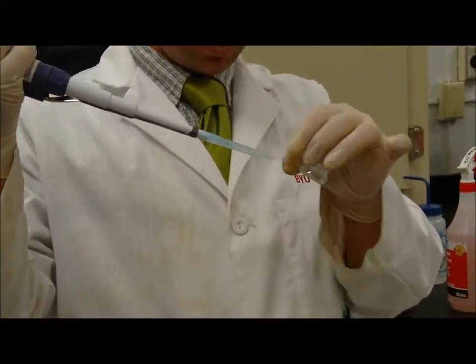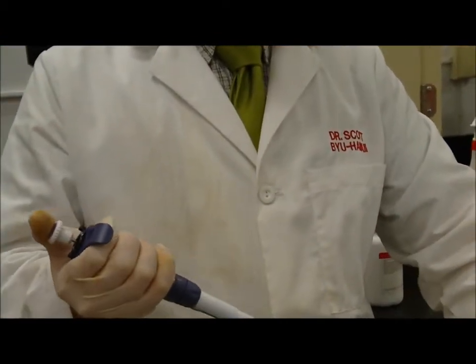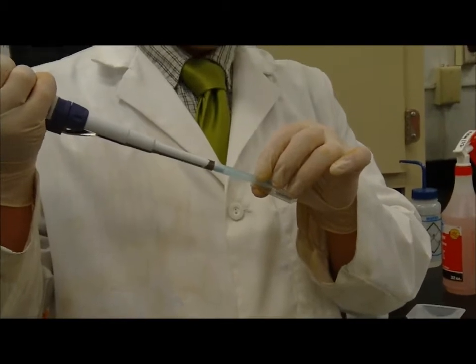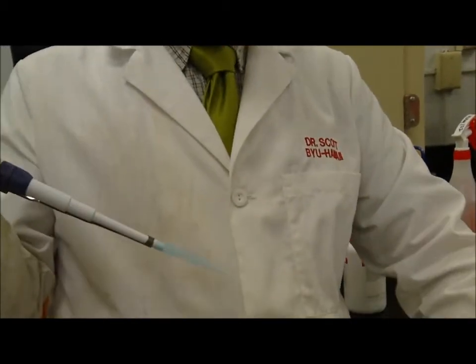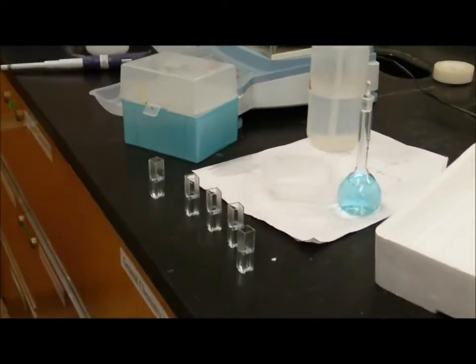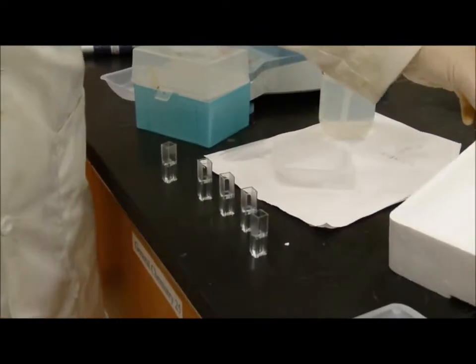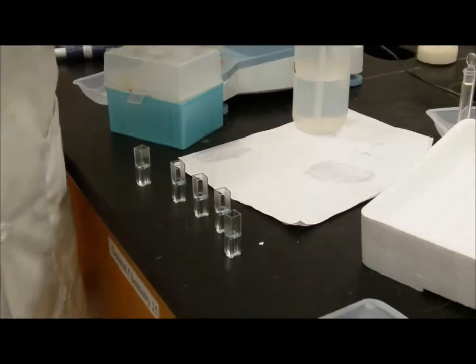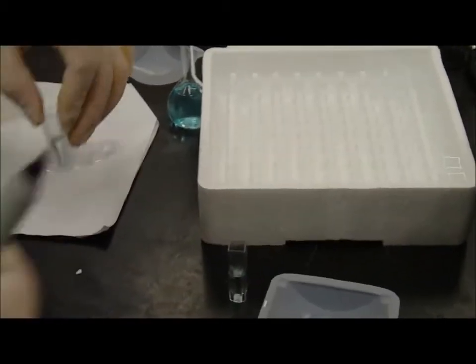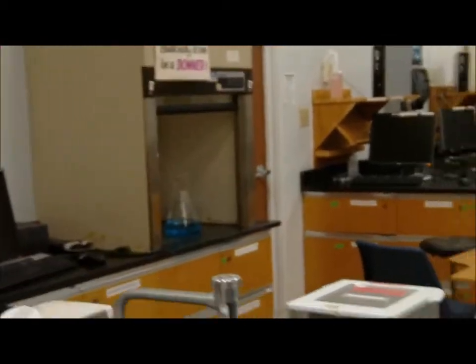All right, so here's my 20, 40, 60%. Here's my 80%. My 100% is already well mixed. All right, I'll write down my values here. My 100% I already did. My 80%, I don't have to blank it, it's the same wavelength. I do want to make sure that there are no bubbles in the way of my window there.